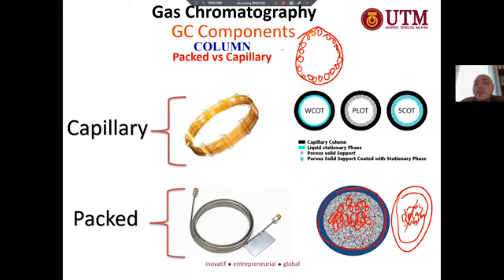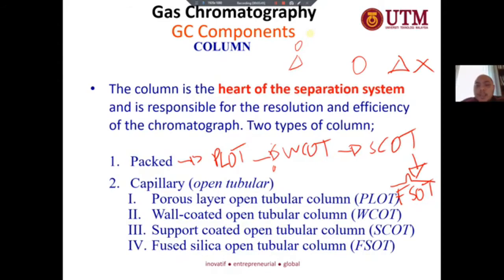If we compare, if we look back here, compared to the three others, here we have the liquid involved. For the PLOT we don't have liquid, no liquid for the porous layer open tubular column.